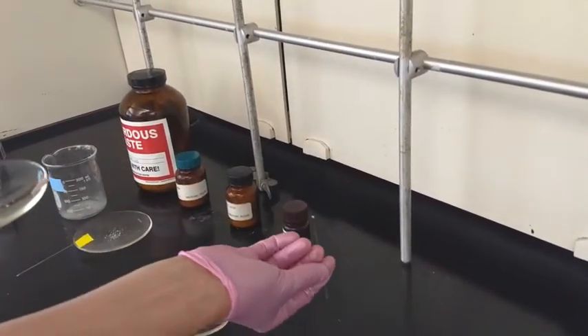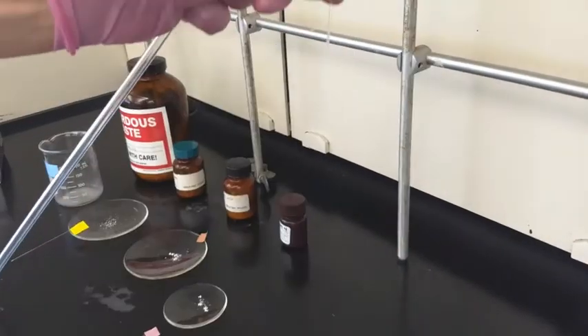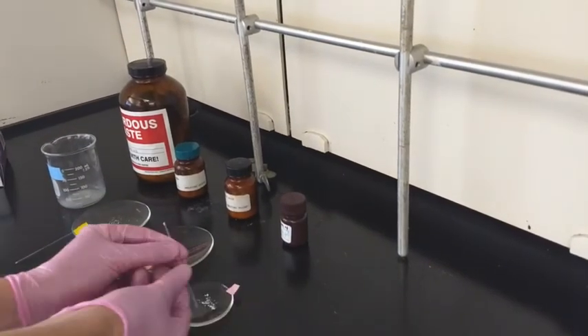With the second sample it doesn't go as easily, so we need to use the other mechanism — dropping it into this long tube. Go get the tube, then go to the melting point station and just drop the capillary in. Dropping it packs the sample into the bottom, unless it's really wet. For the last sample, I'll pack it the same way.